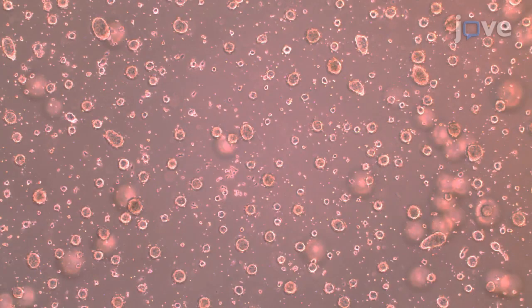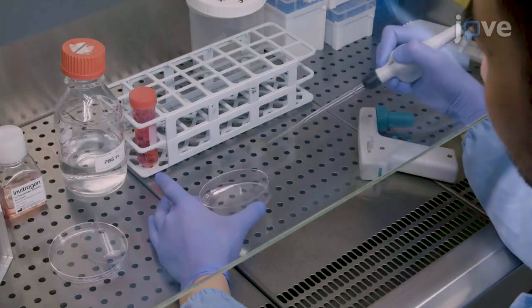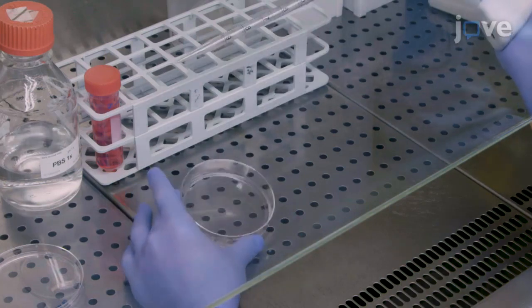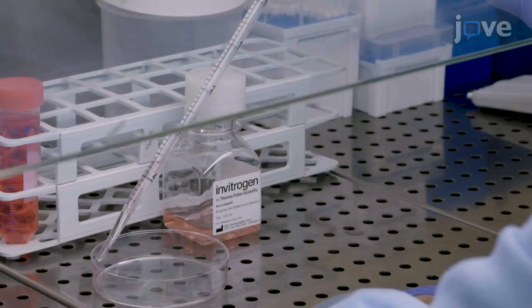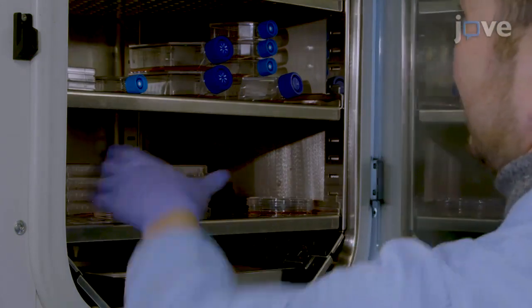To generate embryoid bodies, begin by culturing mouse embryonic stem cells to 60% confluency. Then, remove the culture medium and wash twice with 2 ml of sterilized PBS. Remove the PBS completely and add 2 ml of cell detachment medium. Incubate the culture dish at 37 degrees Celsius.